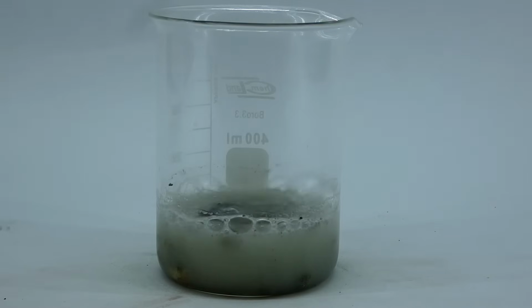Both of them are very brittle and not too reactive, but the addition of sulfur and the production of aluminum sulfide allows the acid to dissolve the sulfide, leaving behind a powder of aluminum oxide and untouched blobs of elemental silicon. This is a very easy way of gently separating the silicon from the rest of the junk, but it has the massive downside in the form of the formation of copious amounts of hydrogen sulfide gas.